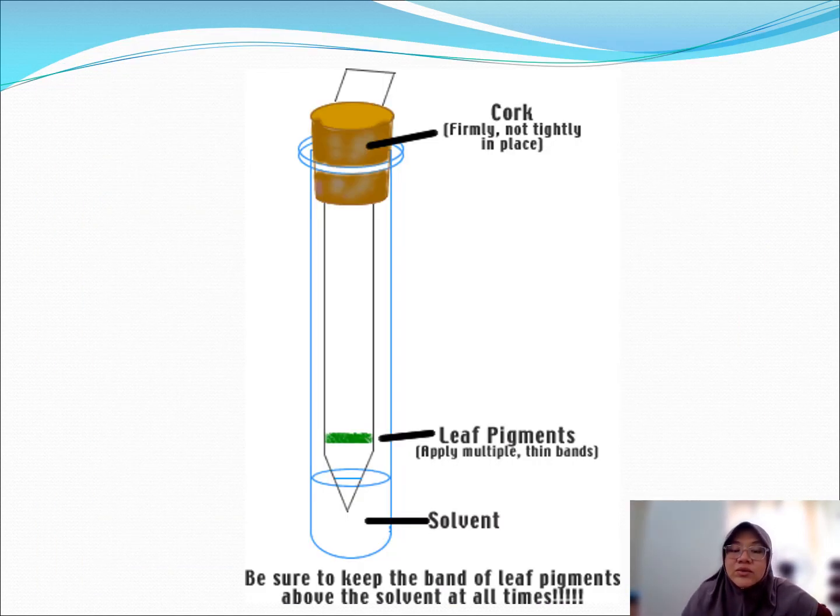Be sure to keep the band of the leaf pigments above the solvent at all times. Okay, jangan letak sampai the pigments yang dekat tengah ni mencecah dengan solvent, because the solvent akan being absorbed, okay, sampailah dia reach top, okay.